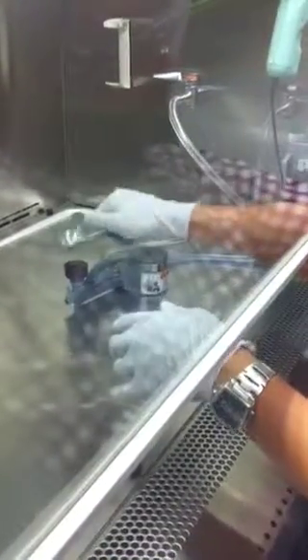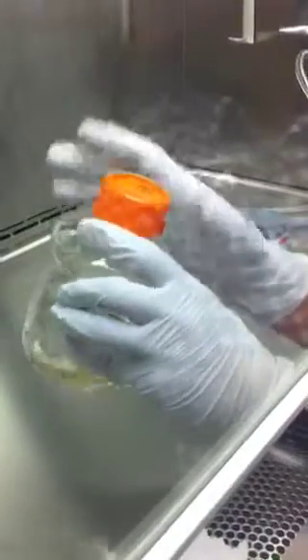Okay. For us, we also have an extra precaution. So we also have an open flame to just flame the cap, but you don't flame it too long because you're going to melt the plastic. Just a couple seconds, enough to burn through the bacteria. So like this. Be careful of your hand, just don't touch the flame.